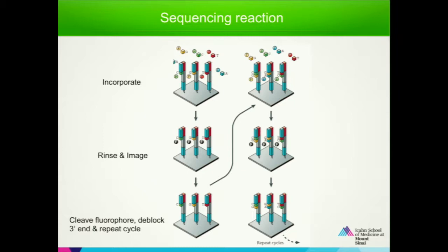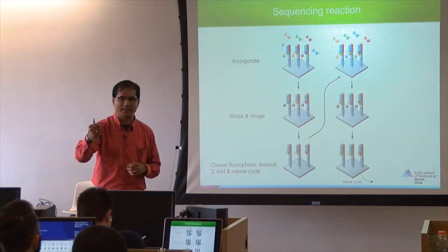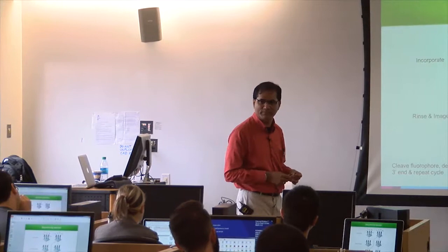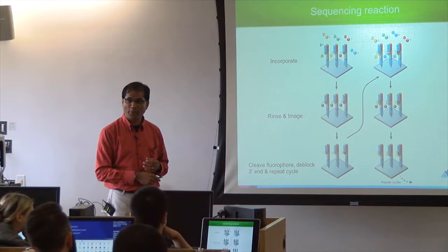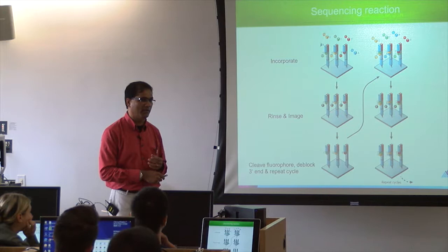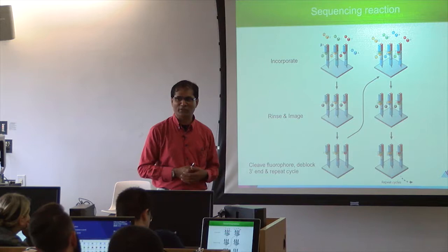You can add one base at a time. Yes, relatively easier, yes. Again, here, homopolymer is also a problem, but a smaller problem. Because you can add one at a time, you can resolve that issue. Suppose there are 20 T's here. You're adding one T at a time. So it doesn't matter now, right? You can resolve that issue also. Cool idea, right? We can do this now.